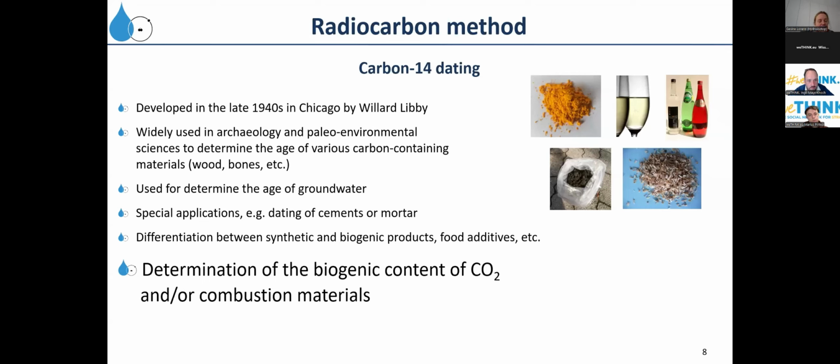Then there is an important application to differentiate between synthetic and biogenic products. And of course, what we are talking about is the determination of the biogenic content of CO2 emissions and or the combustion materials.